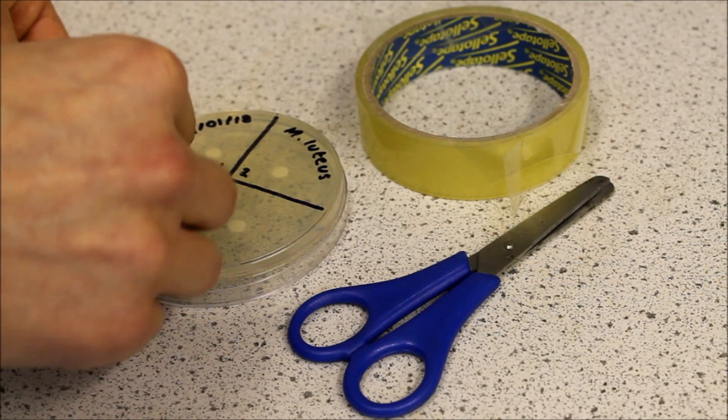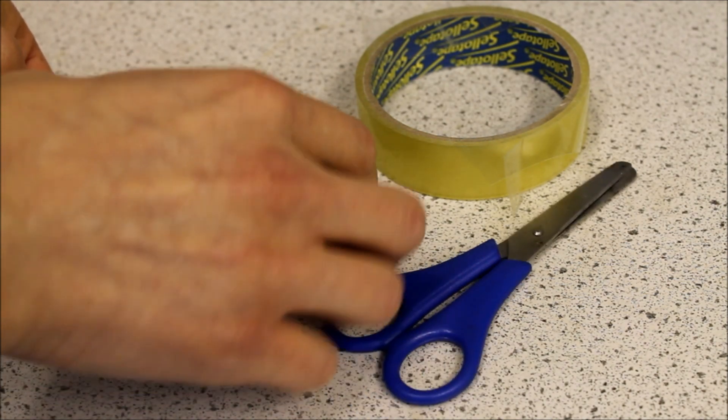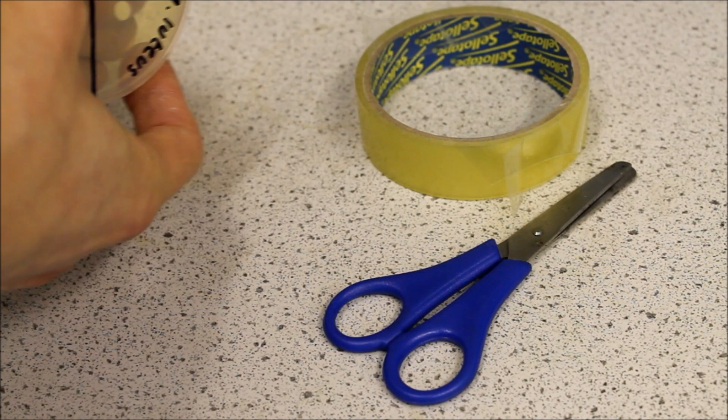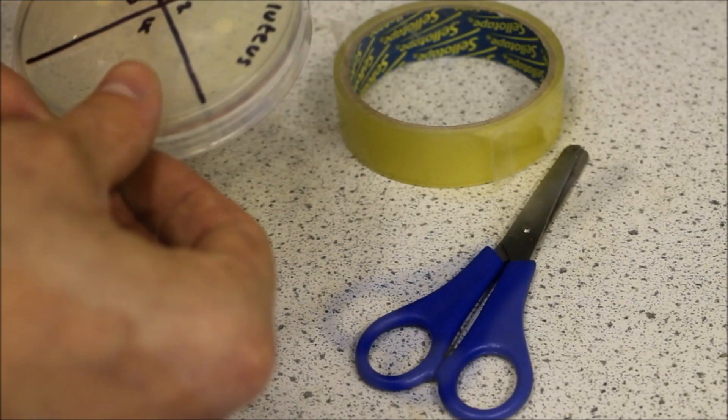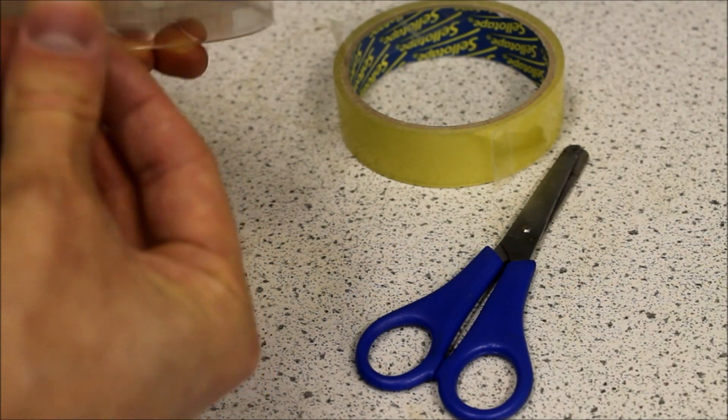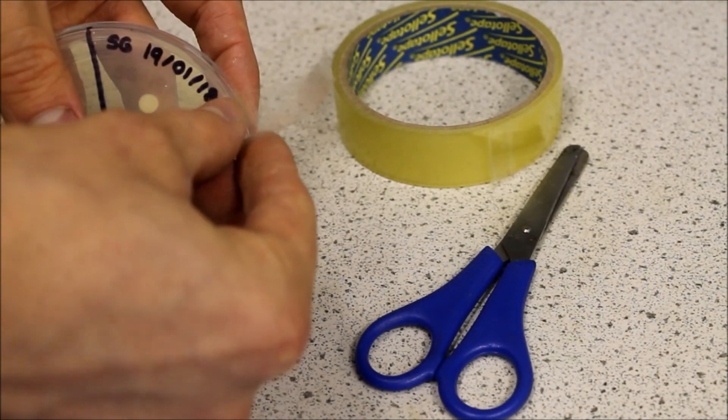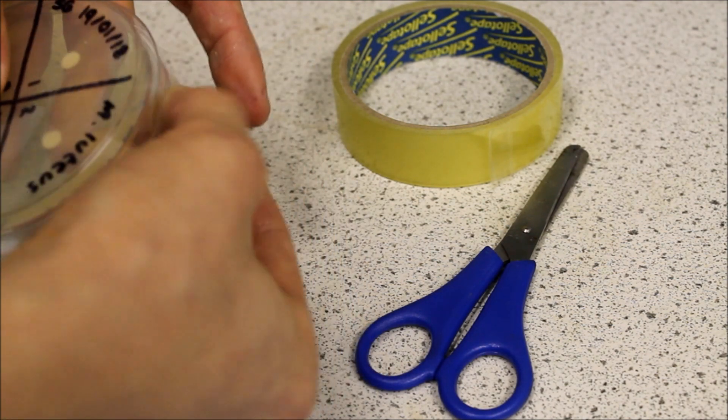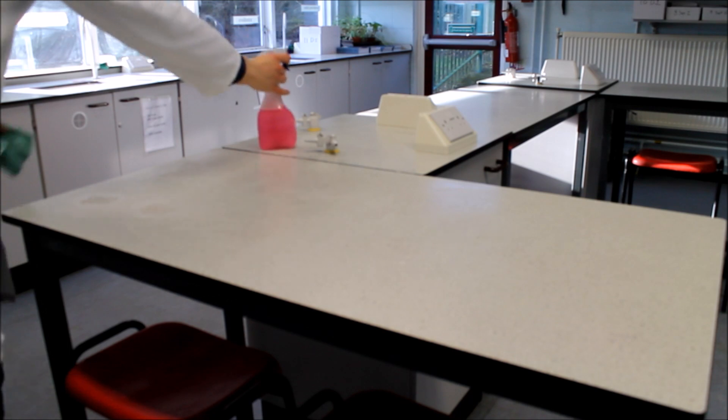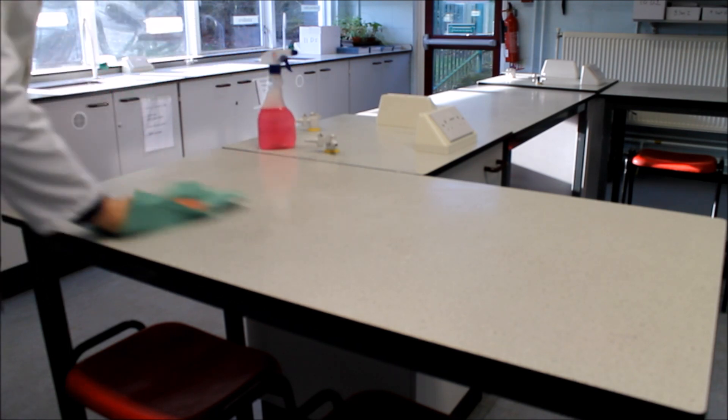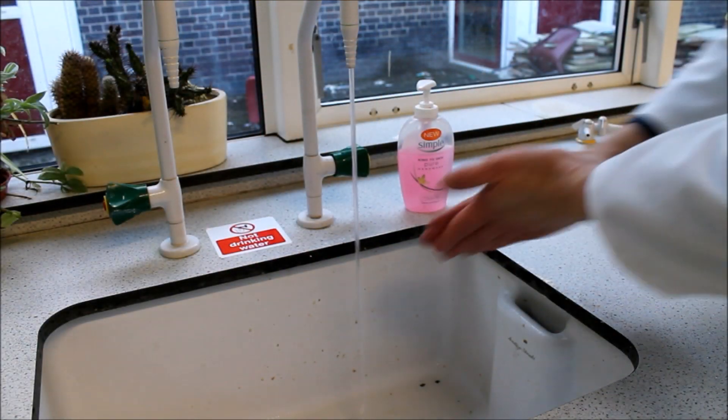In the fourth section place a paper disc without any antiseptic. This will be your control. Use three strips of sellotape to attach the lid to the agar plate in three separate places. Do not seal the lid all the way around as the anaerobic conditions can cause growth of hazardous bacteria. You must now clean the desk again with disinfectant and wash your hands again using antibacterial soap and running water.